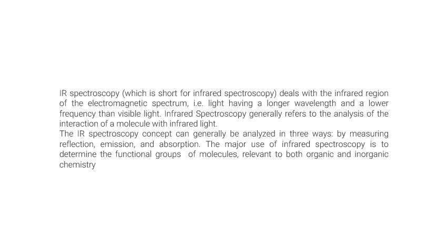IR spectroscopy, which is short for infrared spectroscopy, deals with the infrared region of the electromagnetic spectrum, that is light having a longer wavelength and a lower frequency than visible light. Infrared spectroscopy generally refers to analysis of the interaction of molecules with infrared light.